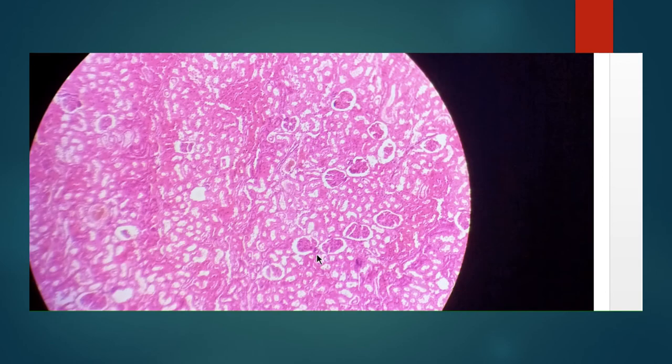And this is a better image you can identify clearly, yeah? So, presence of the Bowman's capsule, presence of the tuft of capillaries, proximal convoluted tubule, distal convoluted tubule. Here you can identify distal, pale stained one. Okay, and these are all the nephrons.